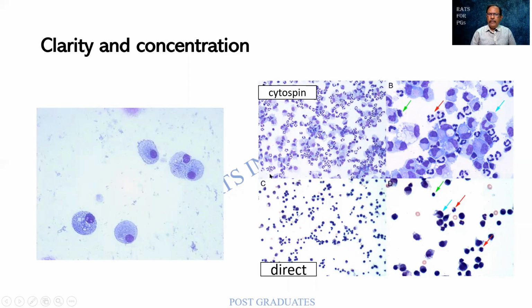This is in a lower magnification to show the quantum of cells. Same thing, if it is kept under a higher magnification, I will be able to appreciate the cellular details. Whereas here it is sparse and thicker, I will not be able to make out the details as much as this. Rather, there is a chance that I could miss a finding.